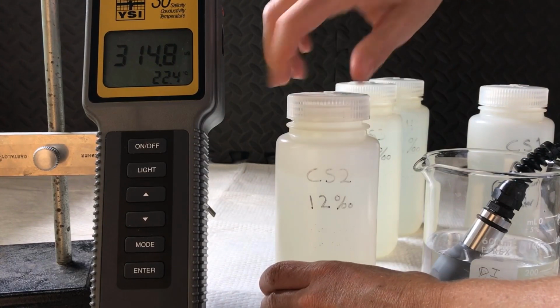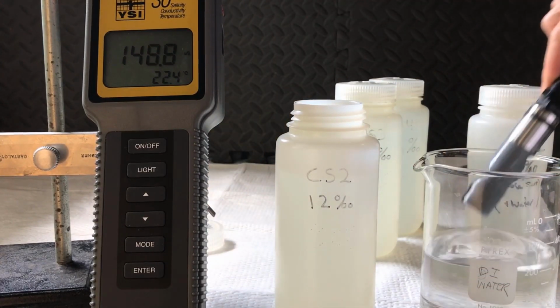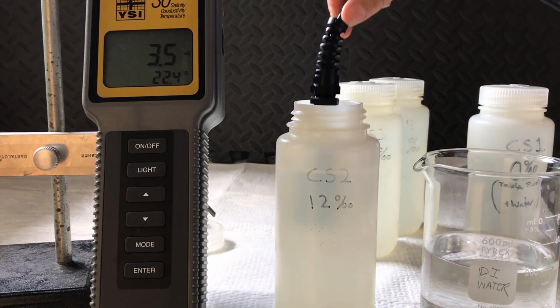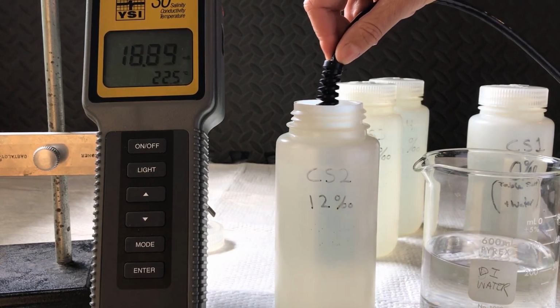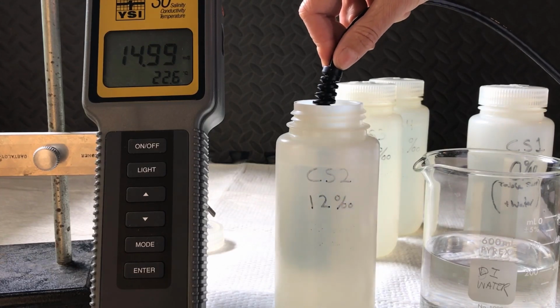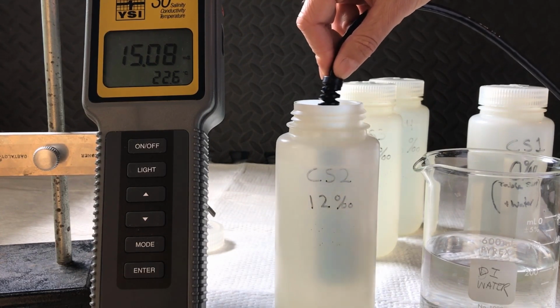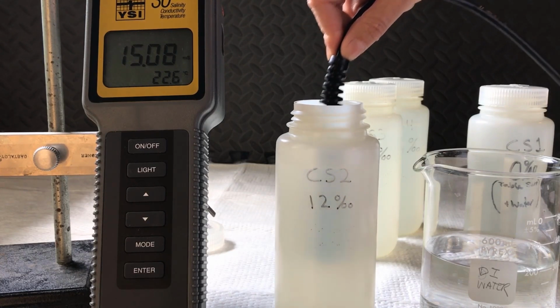Calibration standard 2 has a salinity of 12 parts per thousand salt. This is a larger number, and so we can anticipate its conductivity to be in millisiemens. Put the probe in the solution. The range message means that the probe is changing units. Now we're reading in millisiemens. We'll let this number stabilize. So the conductivity of calibration standard 2 is 15.08 millisiemens.